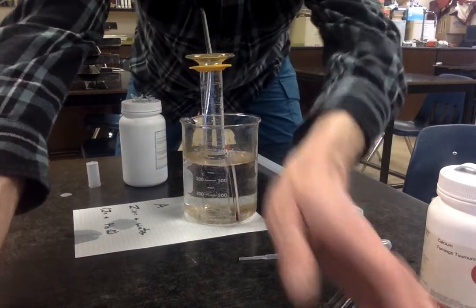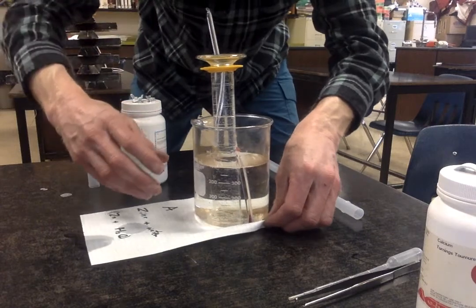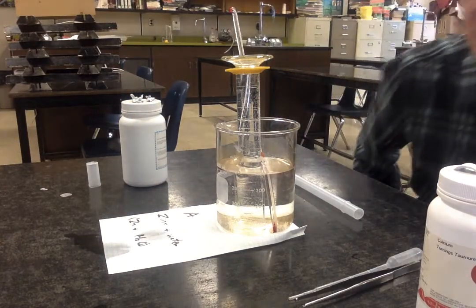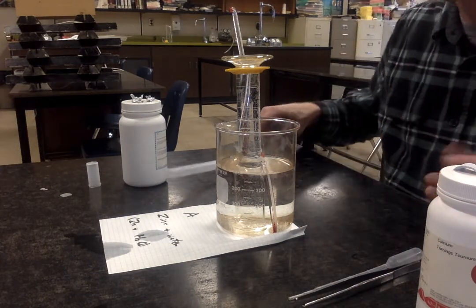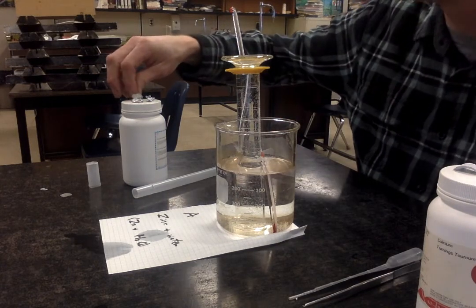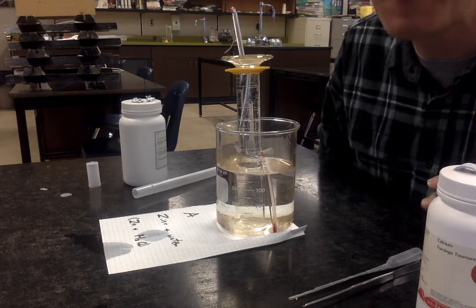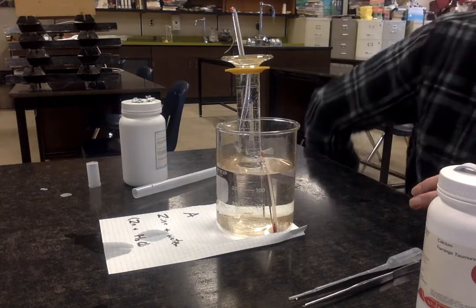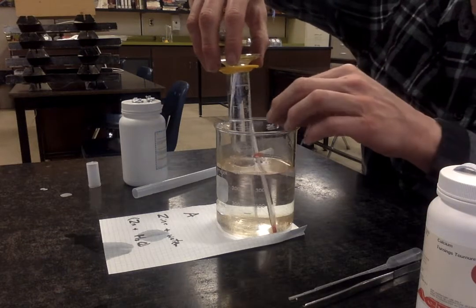We're going to start with zinc plus water. I'm going to put the zinc so it is directly below the graduated cylinder. Any gas that was made in any kind of reaction would then be captured by the graduated cylinder. And graduated cylinders are pretty awesome because they measure volume. We could actually use this to measure the volume of gas that was created, if any is. I'm putting my zinc in.